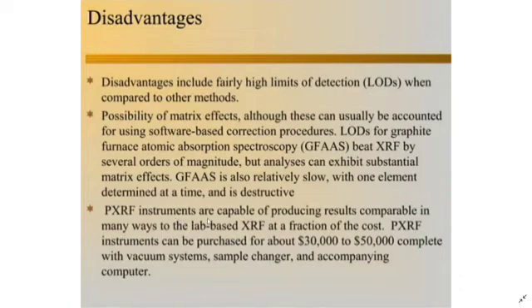PXRF instruments are capable of producing results comparable in many ways to a lab-based XRF at a fraction of the cost. A PXRF instrument can be purchased for about $30,000 to $50,000, complete with a vacuum system, sample changer, and accompanying computer.